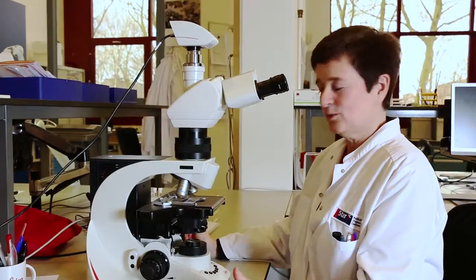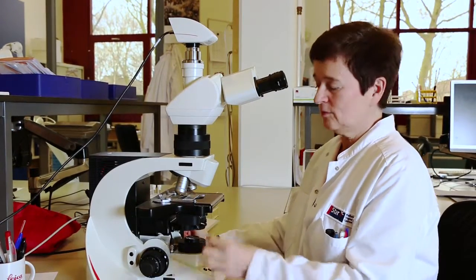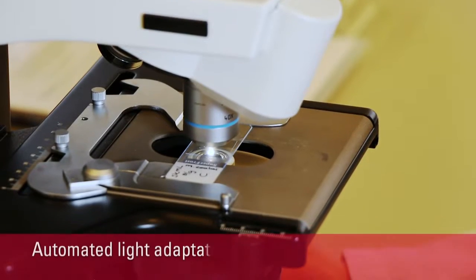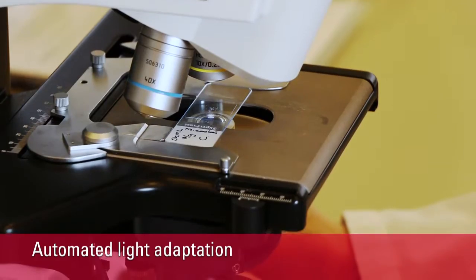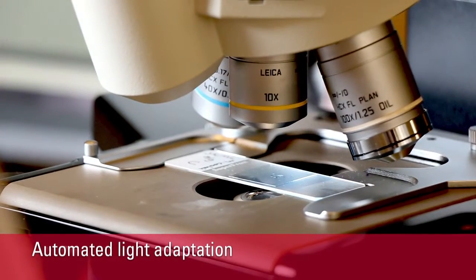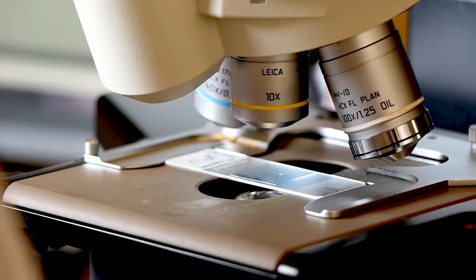Also a good point is when you change the objective you don't need to change anything about the lights. It remembers it so it goes back to the original light intensity when you change objectives.